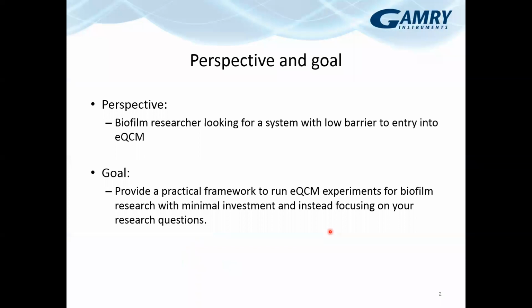The perspective for this webinar, as I've touched on, is that I wanted to help biofilm researchers looking for a system with a low barrier to entry into EQCM. I think you'll find that what's available commercially isn't really compatible with the needs of biofilm researchers.